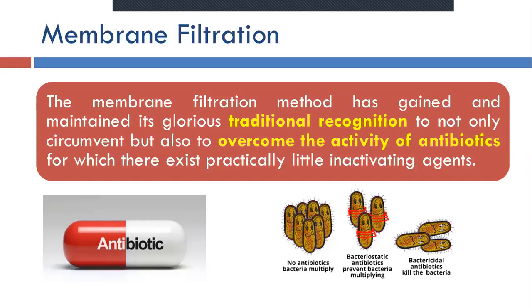Because we are going to filter the product, and we may even rinse it with sterile water or any inactivating agents. Because of that, on the filter paper there will be only microorganisms, either live or dead organisms. So there is no effect of the antimicrobial agents during the sterility testing. That is the reason this membrane filtration technique is invariably given preference in the pharmacopoeia, unless otherwise mentioned or unless the product is not filterable.